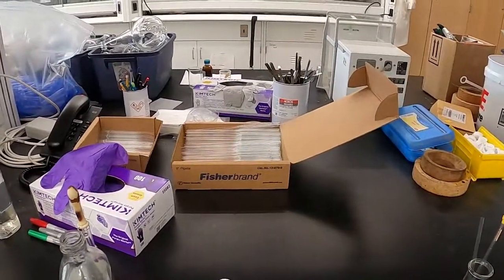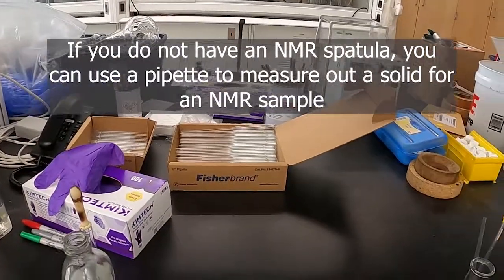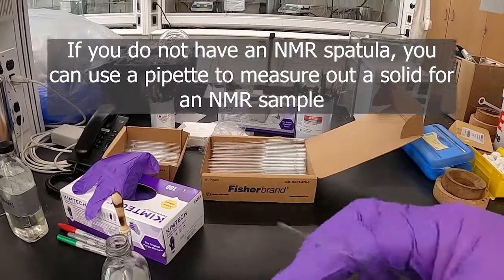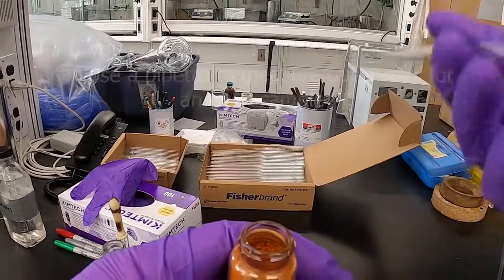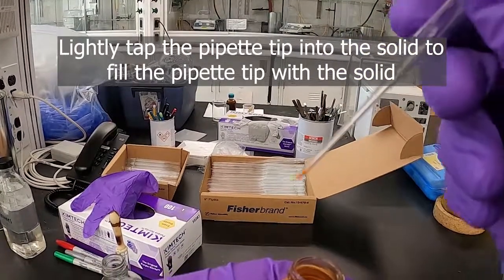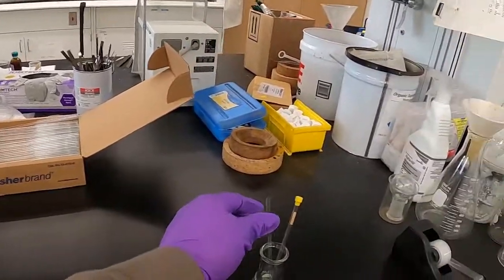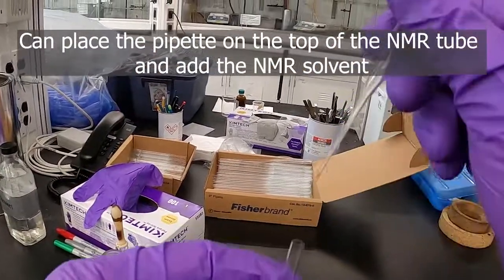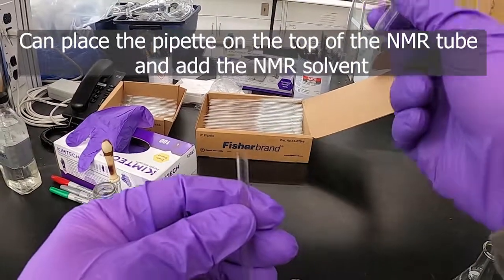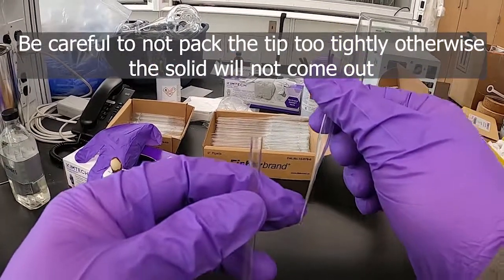Another trick you can do with pipettes is if you don't have one of these fancy spatulas handy, or something that fits into the NMR tube, you can take the pipette and your solid compound, and if you kind of lightly tap it into the solid, it will pack some up in the tip — you can see it there. Then you can put that into the end of the NMR tube and just give it a little shake and it will come out. You've got to be careful not to pack that tip too much or you'll never be able to get it out.